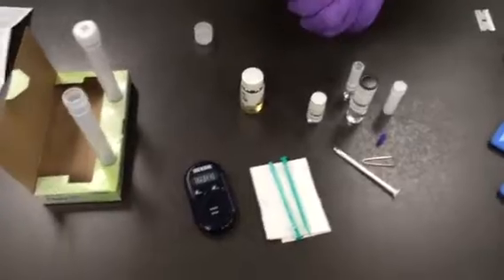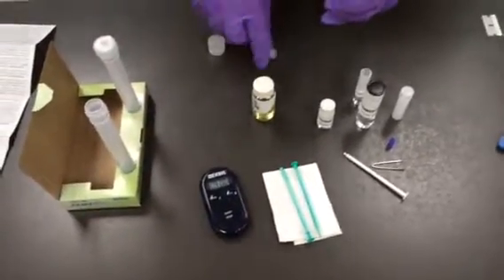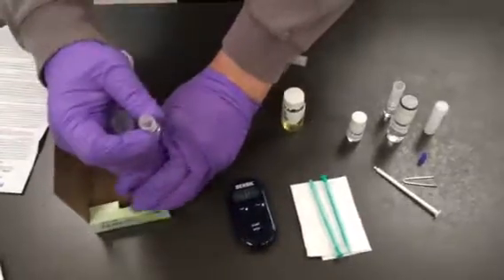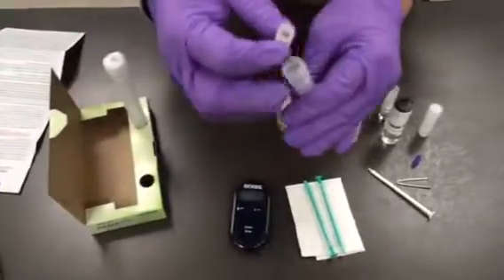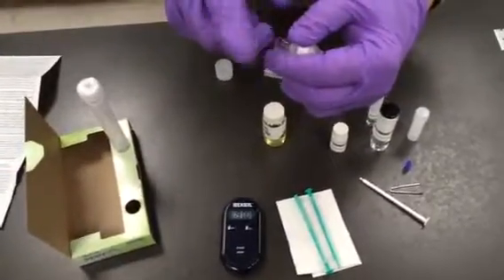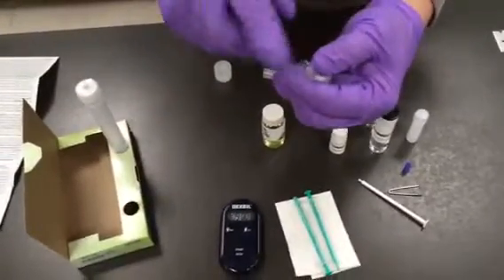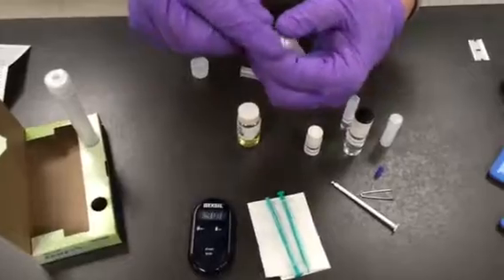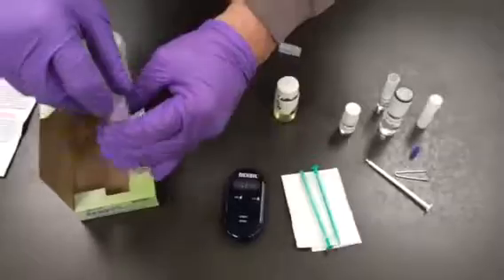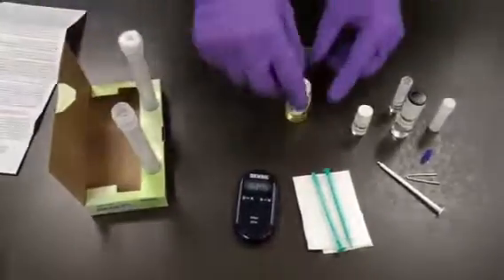The first thing we're going to do is break the reaction solvent ampoule and empty the contents into the reaction tube. The most important thing is just making sure that all the contents are in the tube.